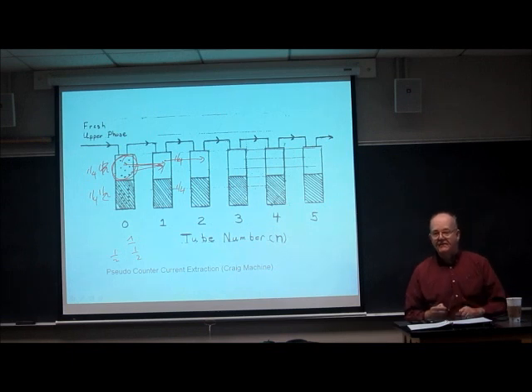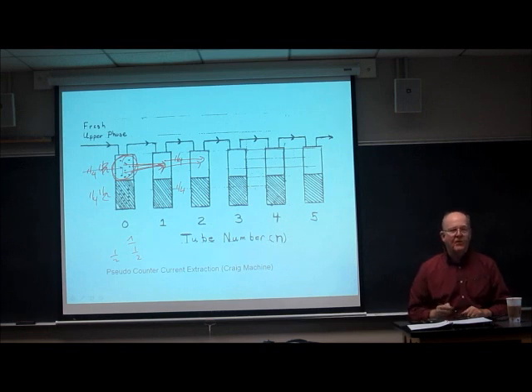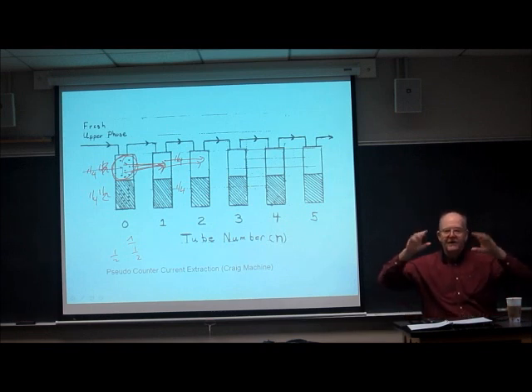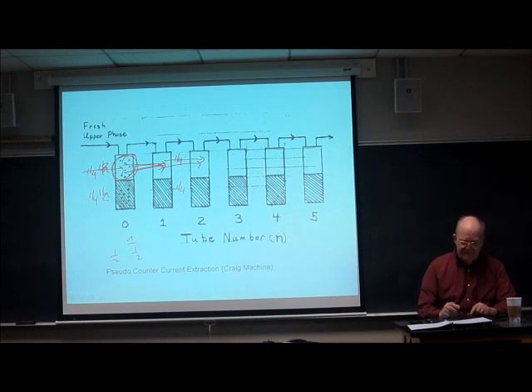Now I'm going to do it again, but I'm going to take what's up here and put it over there. I'm going to take this, put it over here. I'm going to bring in fresh mobile phase, and now I'm going to shake the whole thing again, bring those three tubes to equilibrium. I'm going to have an eighth here. I'm really going to have 2/8 here and 2/8 here. And then I'm going to have an eighth here and an eighth here.